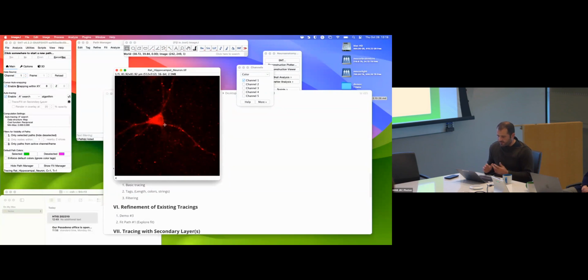And then, it's a semi-automated tracing. The way you do this, you just click on the starting point, click on the end point, and then there is an A star that finds the path. There is no undo in the program. That's kind of a bug, but we make it a feature in the sense that we think it forces people to be disciplined when they are tracing.